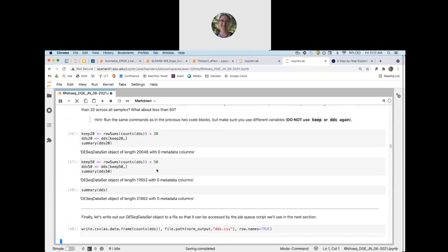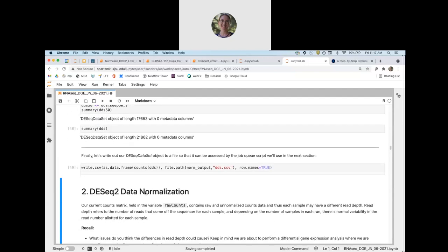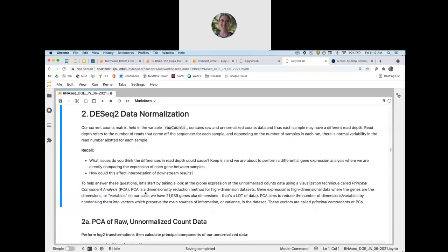All right, so please let me know in the chat if anyone saw any errors or is having any issues. I'm going to slowly move on to step 2, which is where we are going to implement what we just learned about in the statistics lecture.